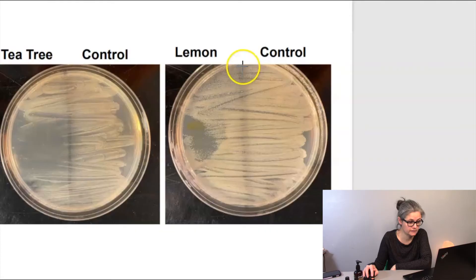And for the lemon, I did the same thing. I had a dividing line down the center here. I swabbed the entire plate and I dropped the lemon right here. And you can see it inhibited the growth over here and it's a little less over on this side here.